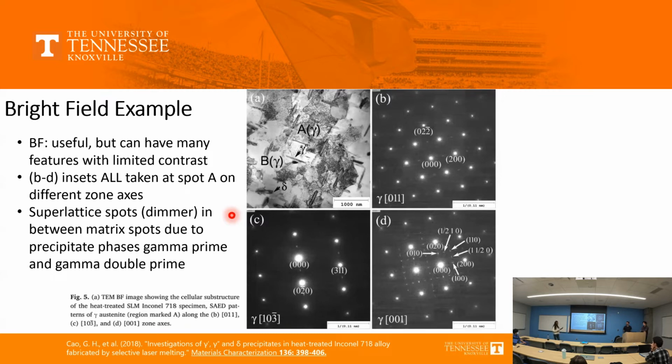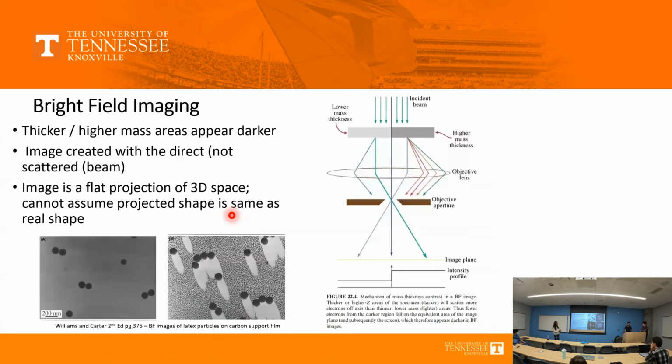Another important point that is in one of the slides, can you go back? I emphasized one thing. Remember, I gave a big lecture on sample preparation other than FIB. Whoever will do precipitate analysis in their career will use something known as carbon film deposition. I talked about it.